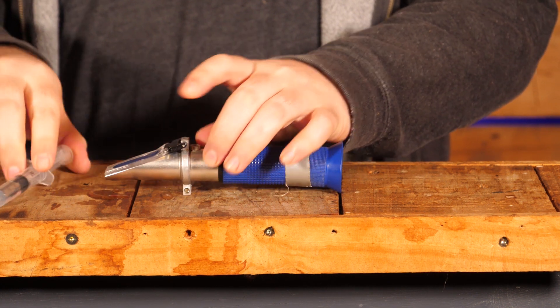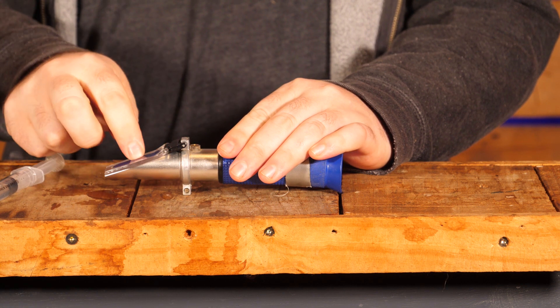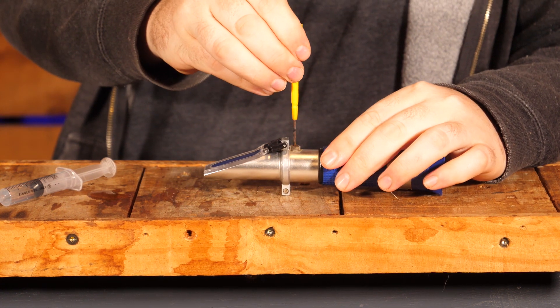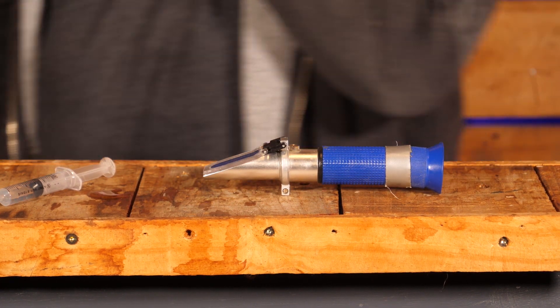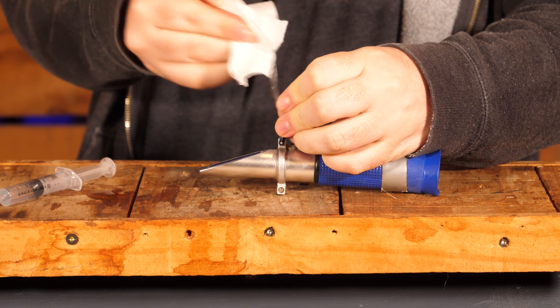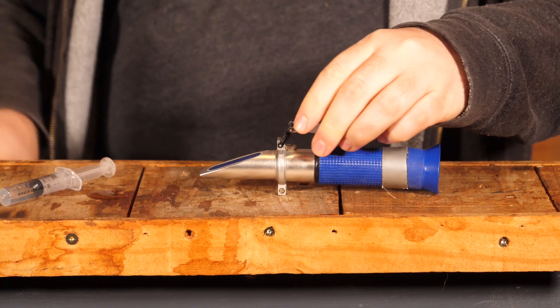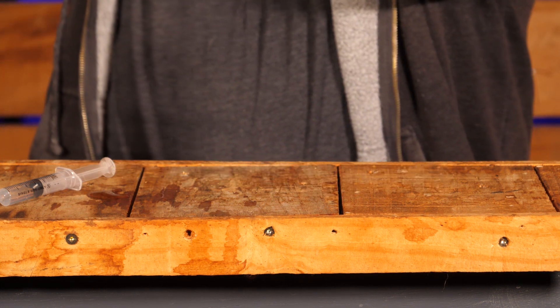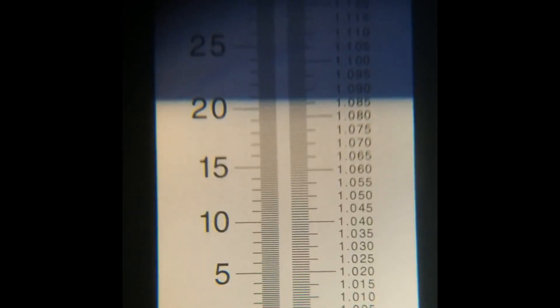Add a little bit more distilled water onto the prism and press the cover down firmly, but not too hard, so most of the bubbles disappear. Then pick it up and have a look through it. Take note of where the blue line is and where it's intersecting with the scale on the left — the Brix scale. Because we have distilled water on there, it should be reading zero. Use a small screwdriver to adjust the small screw on top until the blue line lines up with zero. After another quick wipe, add a small sample of the solution you want to check. In this case, it's reading pretty much exactly 21 Brix on the left hand side.